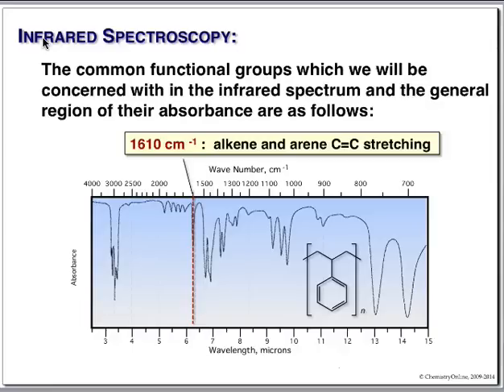So what I'd like to do is start up here again at the very high energy part, and let's look at all of the functional groups, and let's look at examples of all of these stretches.